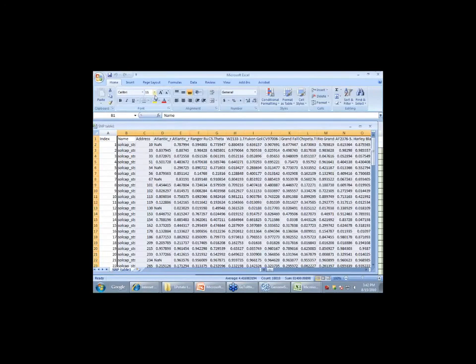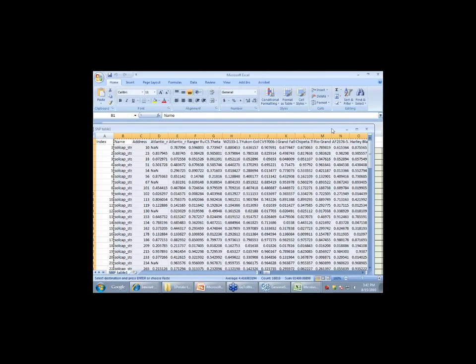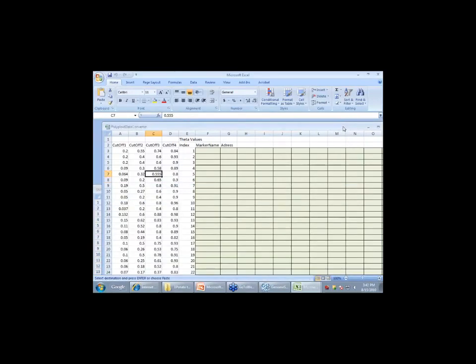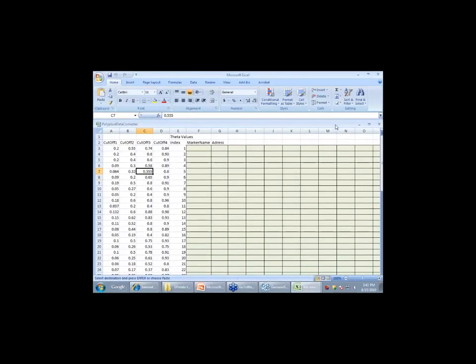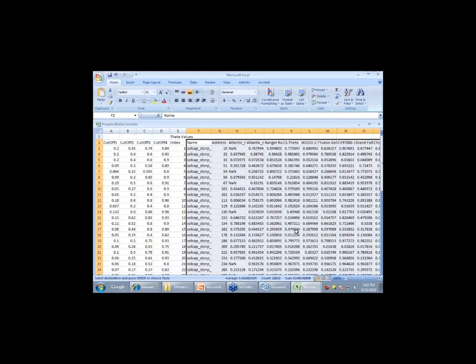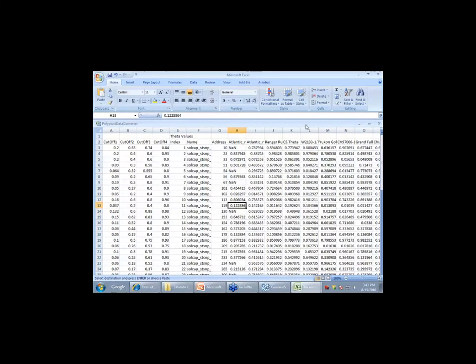So we're going to go copy. You can hit this little icon over here or hit Control C. That's in the clipboard. Then I can go back to this file over here, the Polyploid converter file. Has everybody got that? They've captured the data? We're going to click on marker name, and we're going to paste. So that's the data.